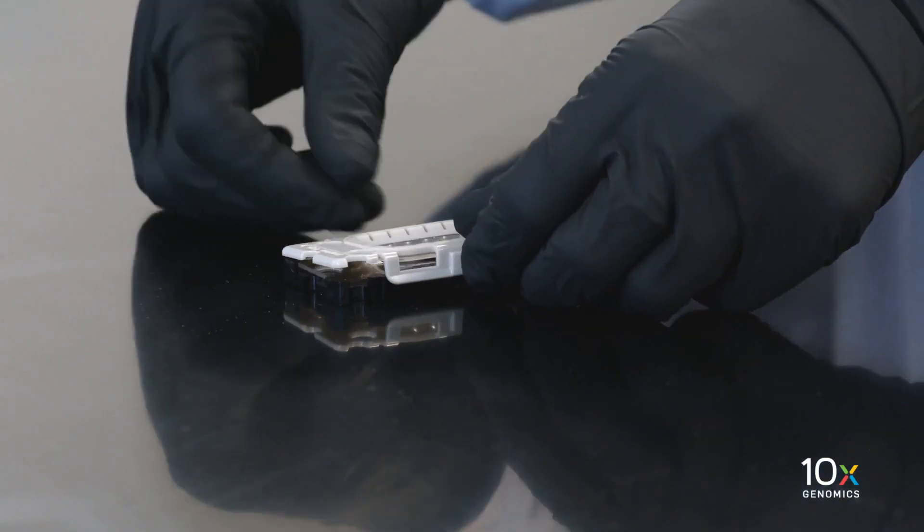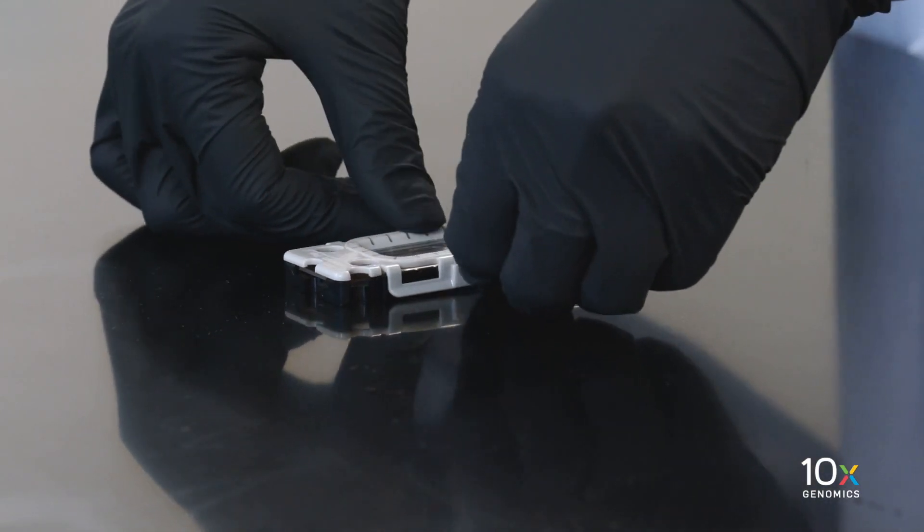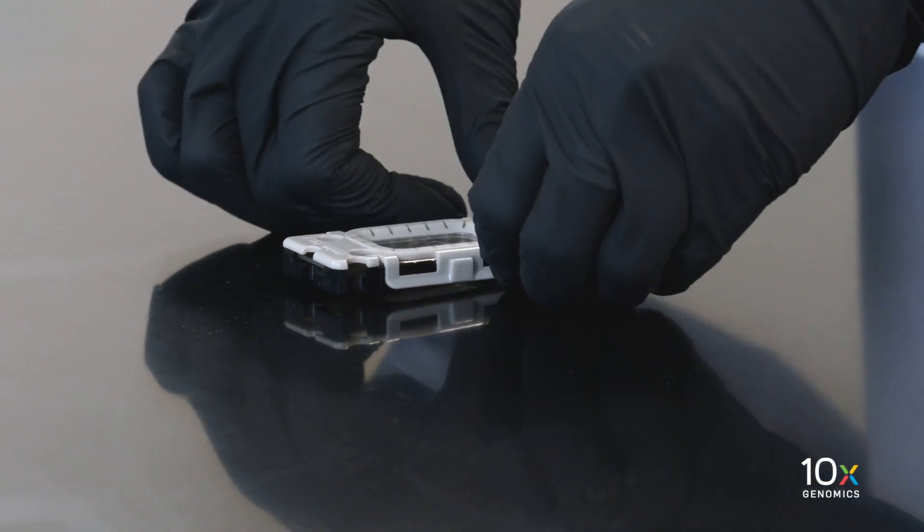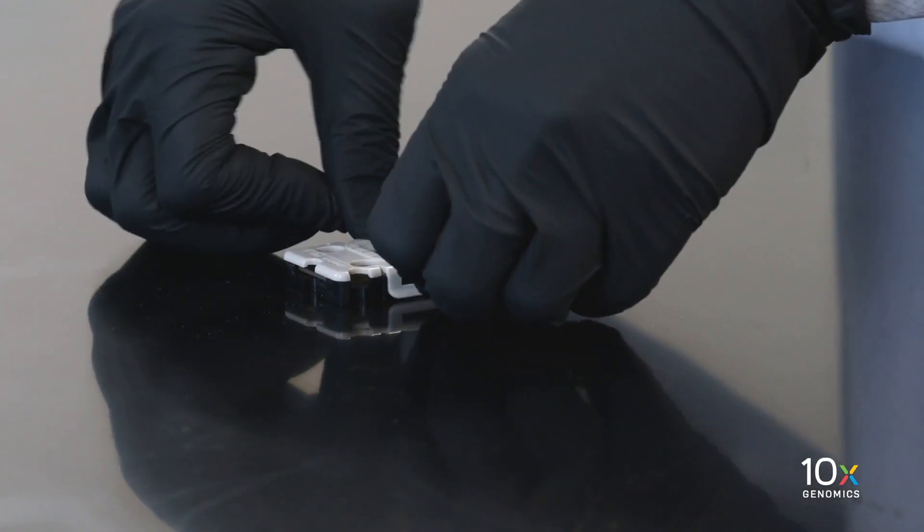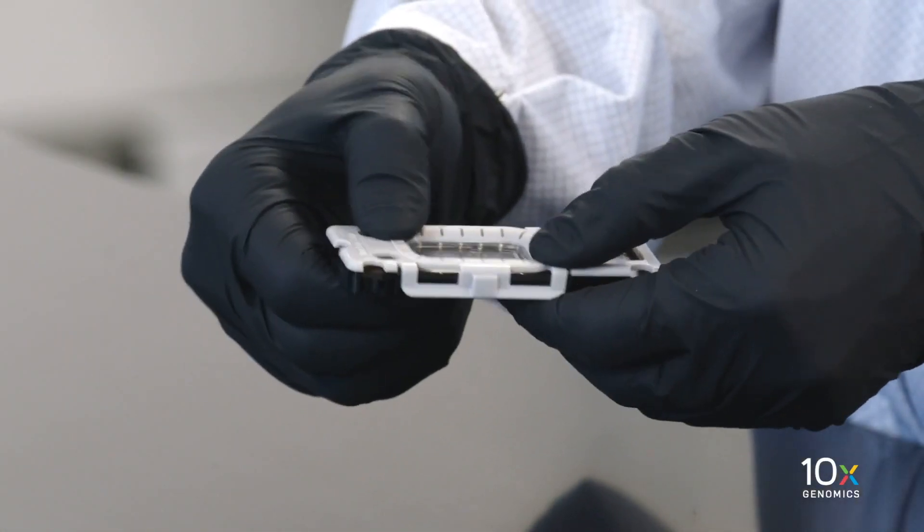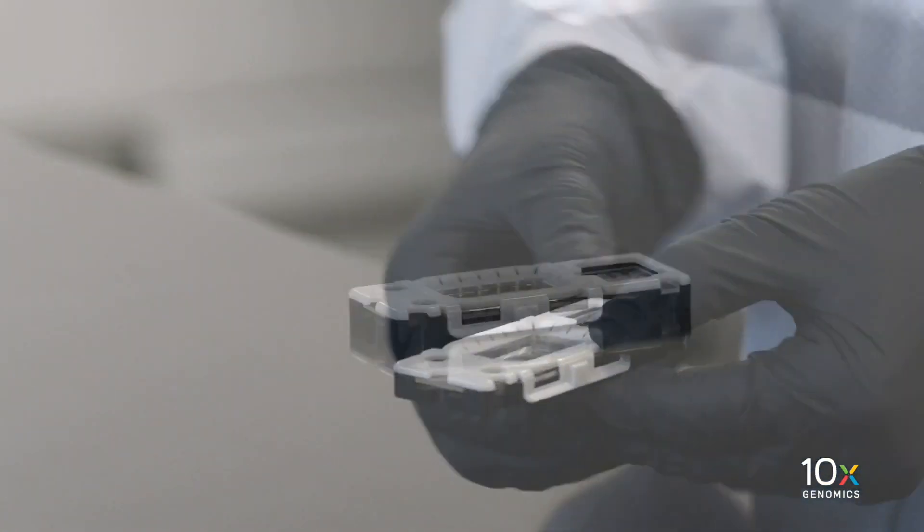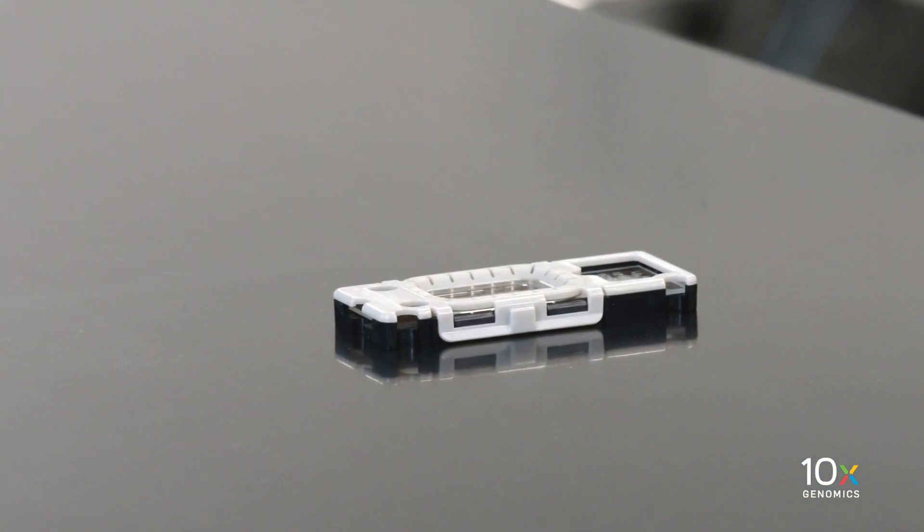Secure the outer clips on the top half of the cassette with the outer tabs of the bottom half of the cassette on both sides. Press firmly on the top of the cassette until it clicks shut and the two halves are flush against each other. We are ready to add reagents into the assembled cassette.